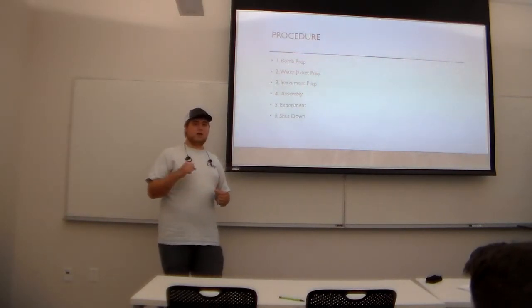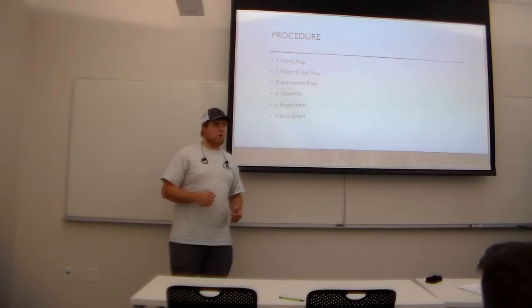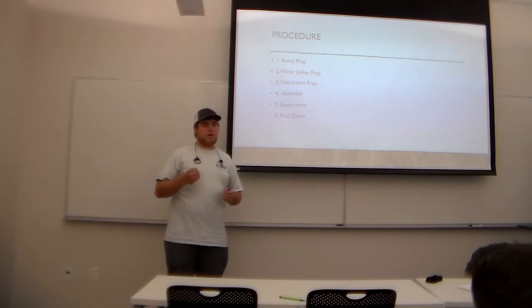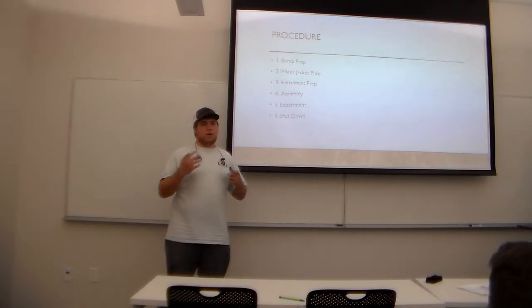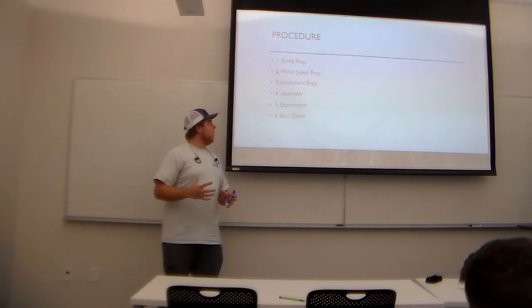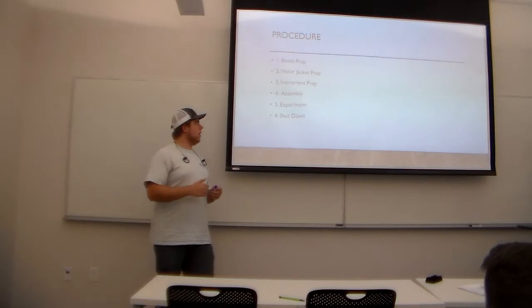You'll connect an oxygen tank to the bomb to pressurize the bomb. Then you want to release that pressure and then pressurize it again, release it one more time, and finally repressurize it. That purges the bomb of all the regular air and makes sure it's pure oxygen in the sample. From there you want to prep the water jacket, which is basically putting the water in the outside container. And then you want to make sure your instrument is connected to a computer. From there you put the bomb inside the water jacket and seal that all up to begin the actual experiment.